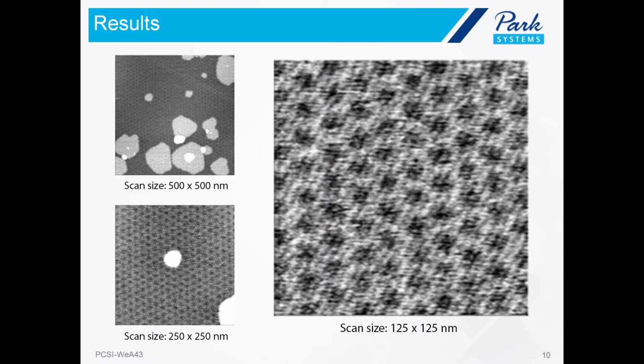You'll see that they're staggered. Yes, they're definitely staggered, but they're occurring, again, at regular intervals and at more or less the same diameter as one another. One superlattice constant isn't bigger than the other. It's definitely something that's uniform, that's repeating.